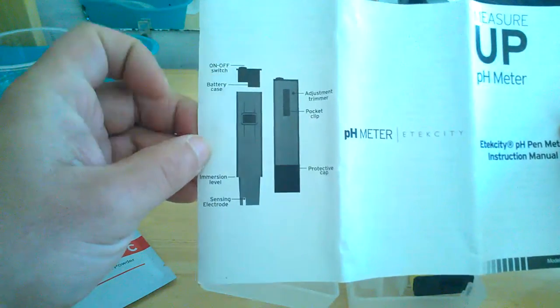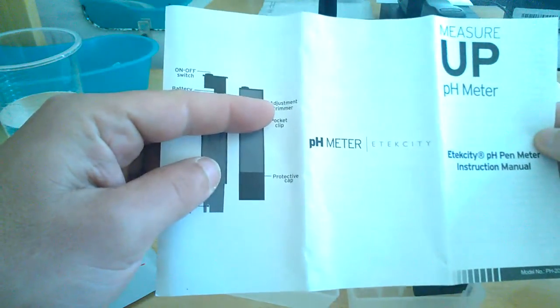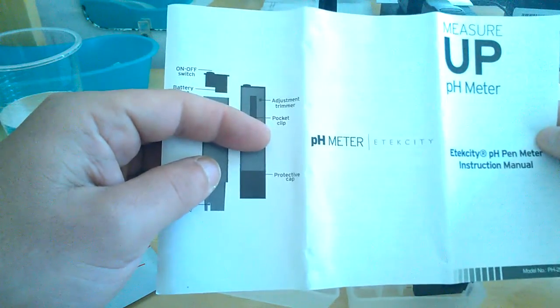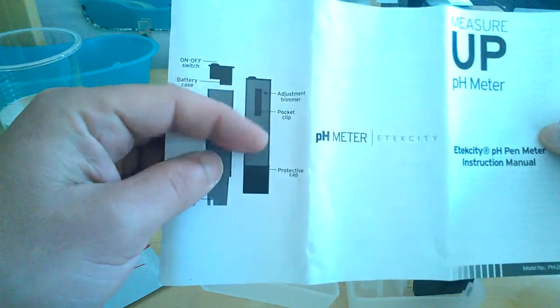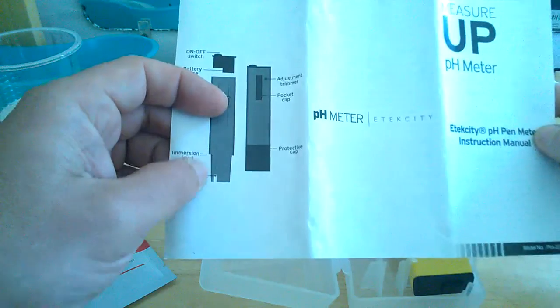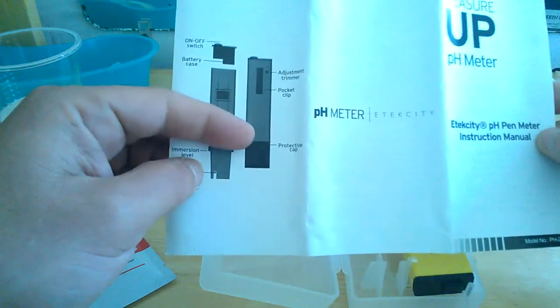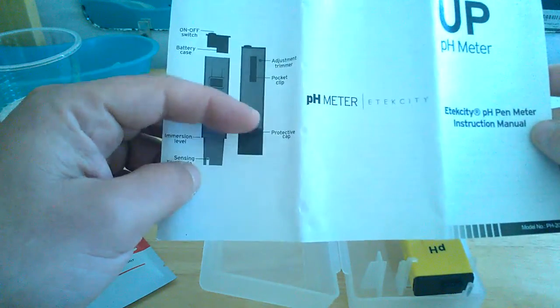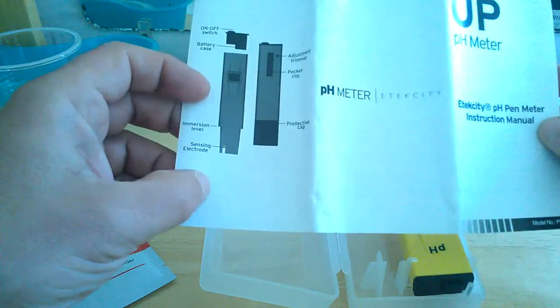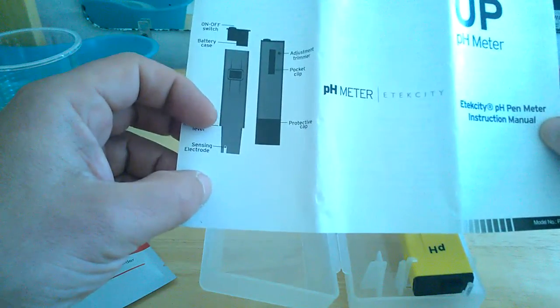Your battery case. The batteries are pre-installed. You've got a pocket clip. You have here an adjustment trimmer which is this little circle here which you use the provided screwdriver to tune in the model, fine tune it. You've got a protective cap over your electrode and stuff like that.